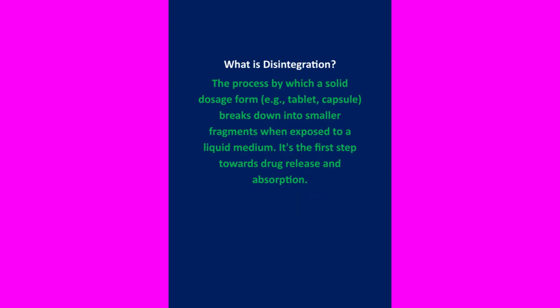We will discuss important questions and answers on DT apparatus in pharma. What is disintegration? The process by which a solid dosage form, for example tablets or capsules, breaks down into smaller fragments when exposed to a liquid medium. It's a first step towards drug release and absorption.